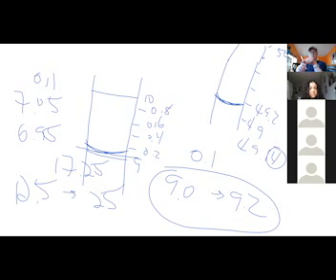I have another question. Let's say all of the masses for the cups we measured have 4 significant figures, but then when we do the average, we get 5 sig figs. Should we round that to 4, or should we keep all of them when we're doing the average? Sorry, when do you get 5 sig figs? When I'm finding the average. That's a good point.